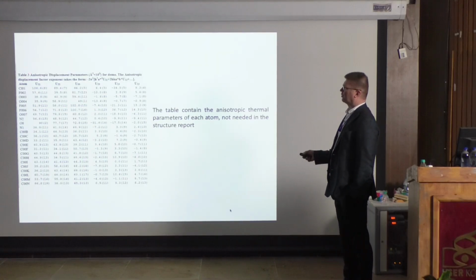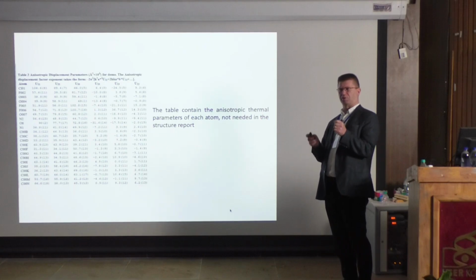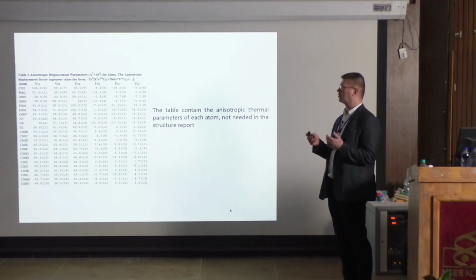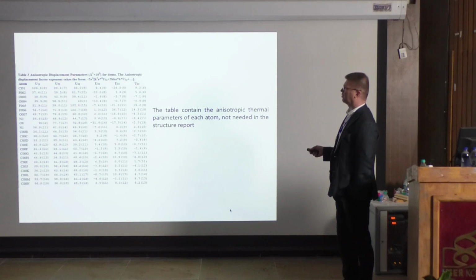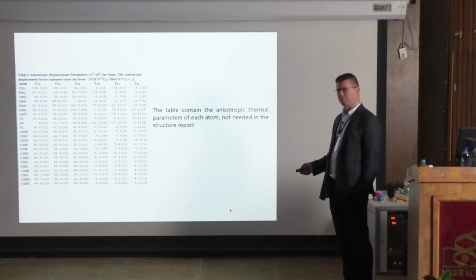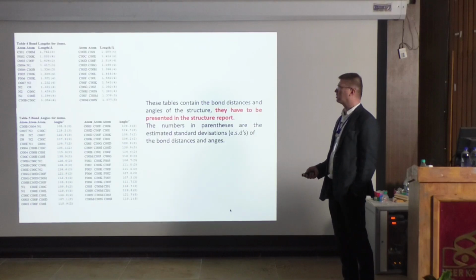And then it also makes a more accurate table on the anisotropic displacement parameters. Remember that the atom when we started was like a ball, but when we finalized it looks like an ellipsoid. These are called the anisotropic displacement or thermal parameters, and these are just numbers, so you don't have to worry about this. It's printed, but you actually don't need that.